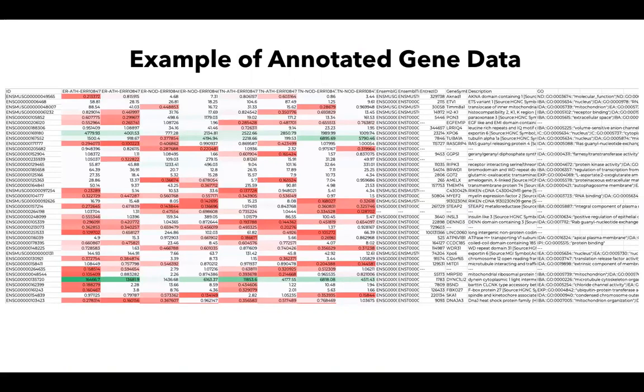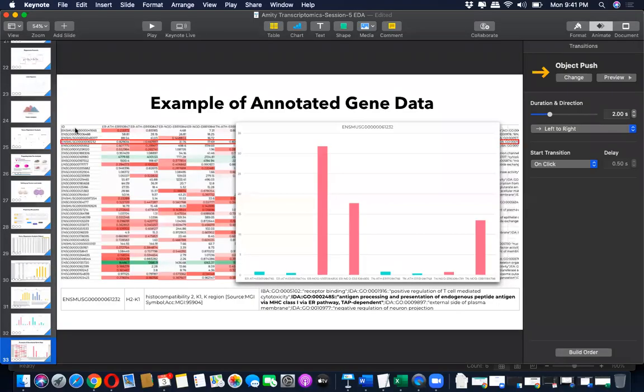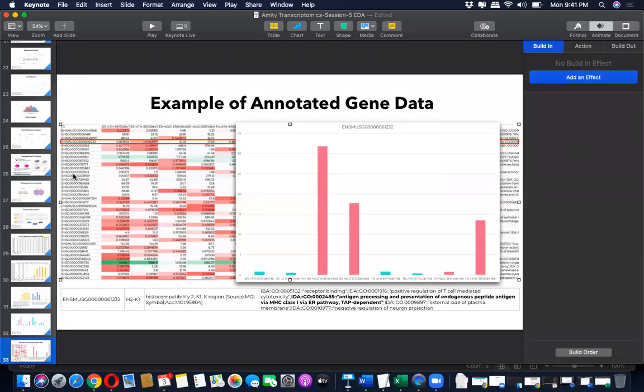So when you put these numbers, the gene IDs, into DAVID, it will tell you what kind of genes they are, what their function is, and stuff like that. DAVID is also described in Transcriptomics 1. So once you find these important genes, you can use DAVID to learn more about them.